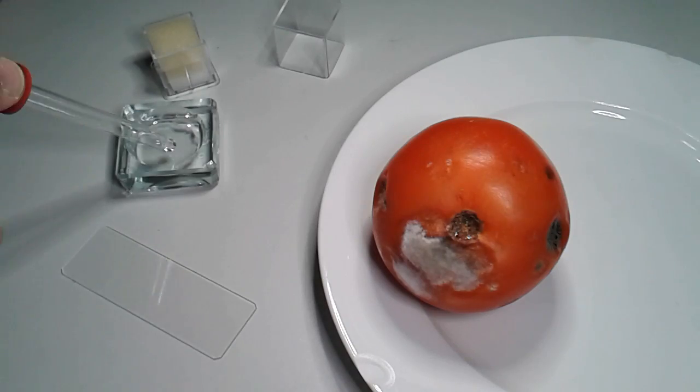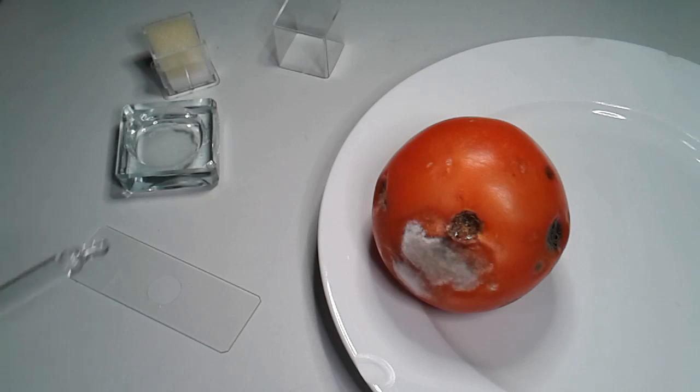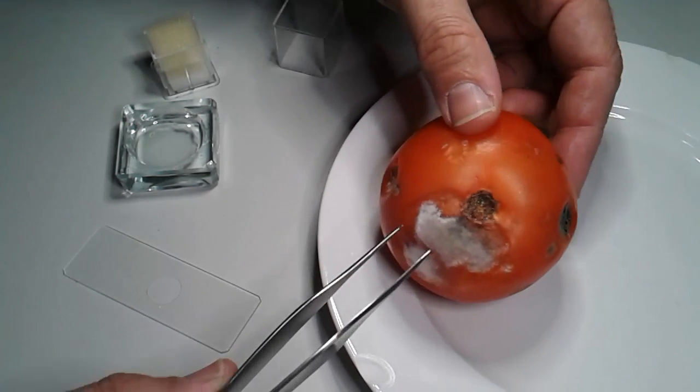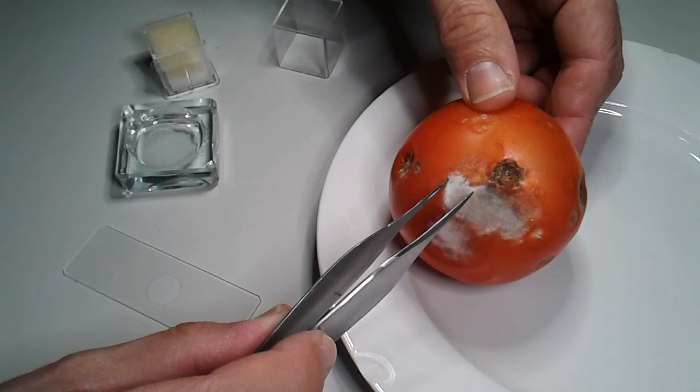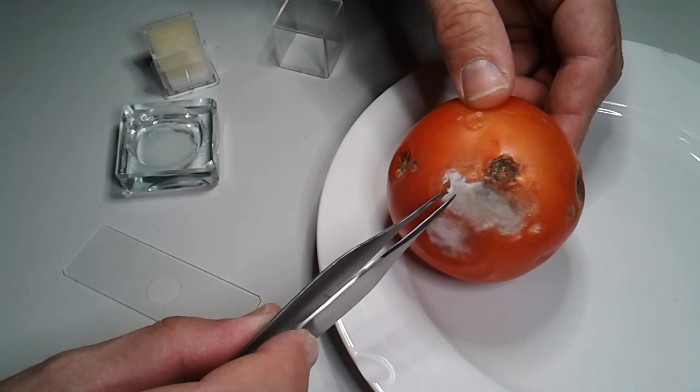The mycelium is of course made of cells, which I'm going to look at right now. I place a drop of water on the microscope slide. This also prevents the spores a little bit from flying away. And then carefully with my tweezers I try to take off and scratch off some of the mycelium to be observed.